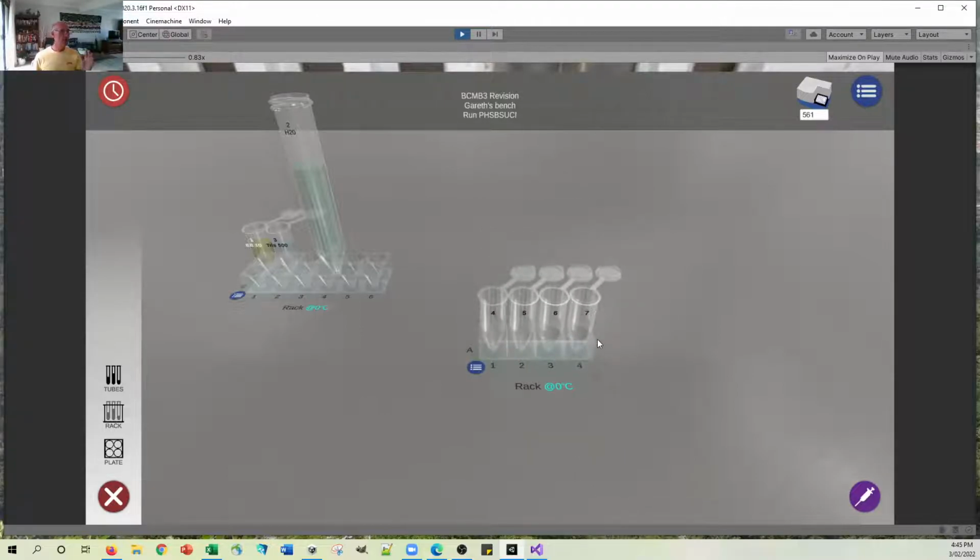And I'm going to make a sort of 1 in 5 dilution, so 100 millimolar tris, a 1 in 10, so 50 millimolar, and then I'll do 25 millimolar and 5 millimolar. And what we should see is that that one stays yellow and these all go blue. And if we keep it in water, it should go blue.